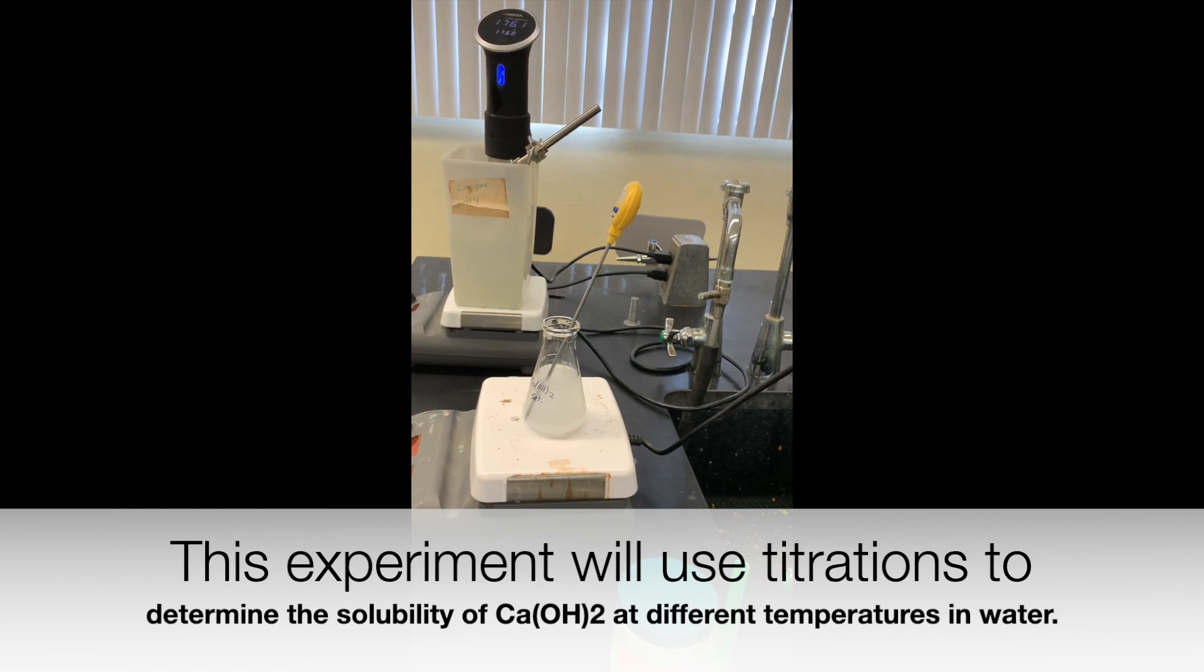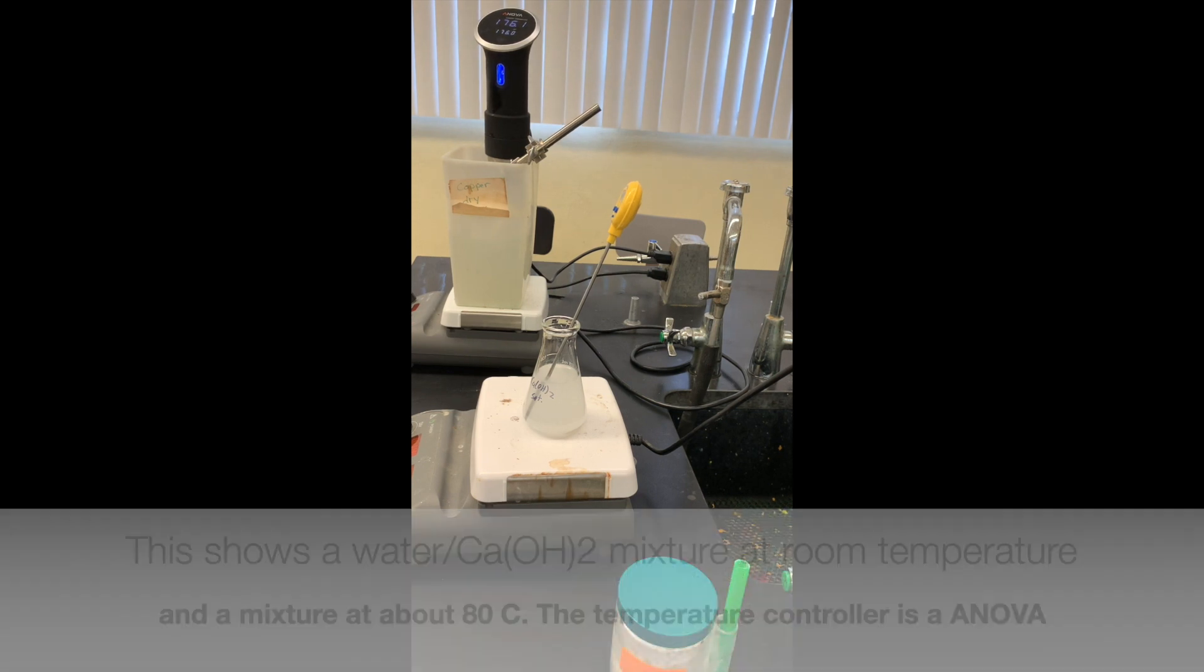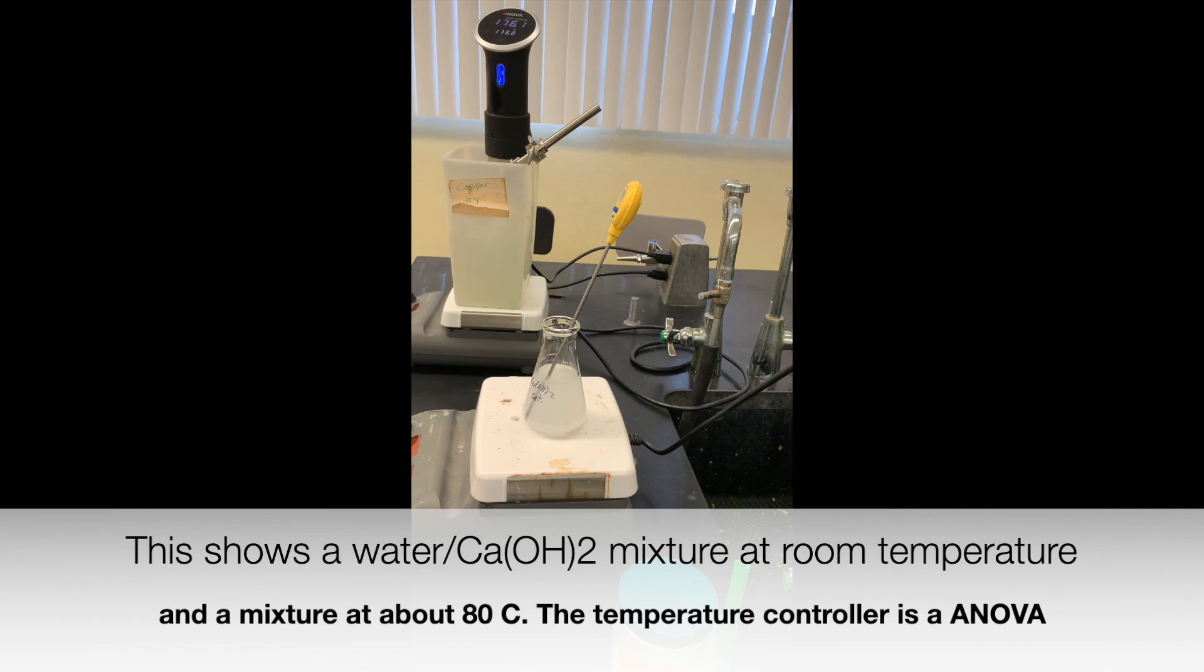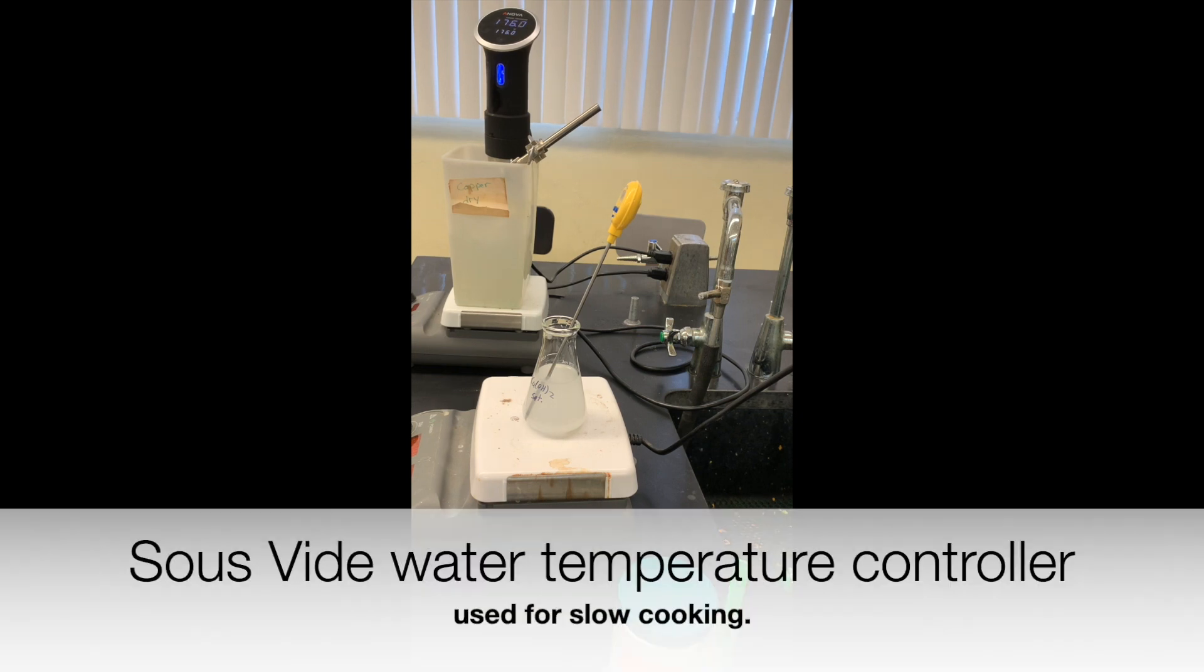This experiment will use titrations to determine the solubility of calcium hydroxide at different temperatures in water. You will use this data to calculate the KSP and some thermodynamic factors.